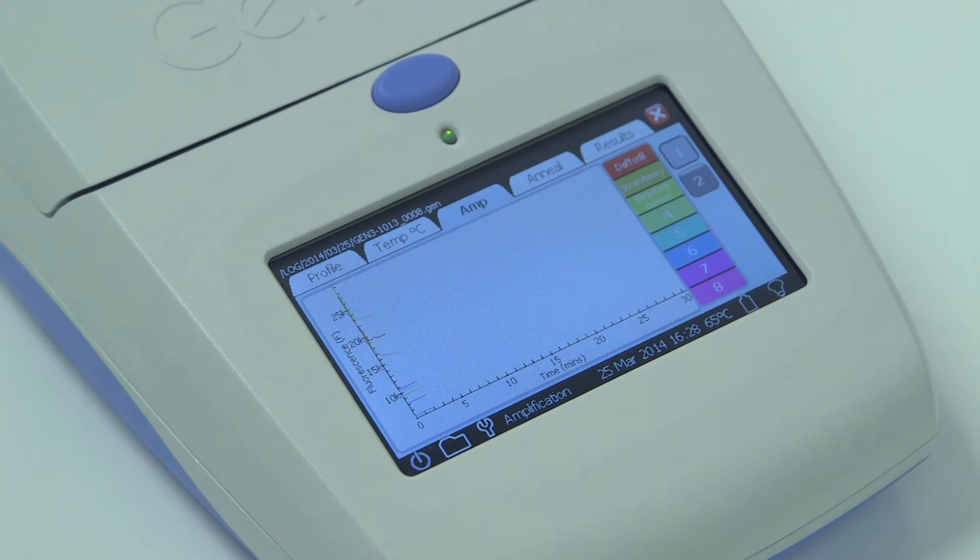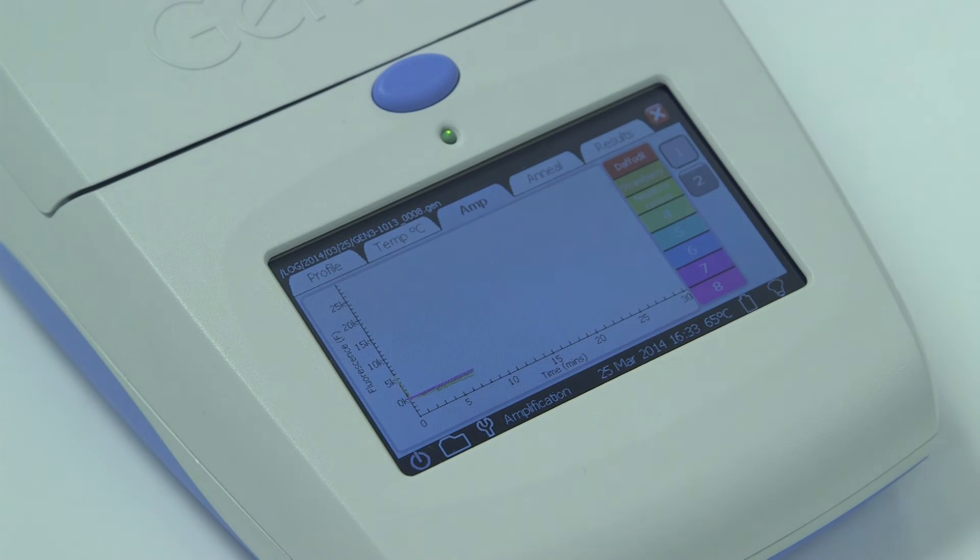Amplification can be seen to occur at 10 minutes for the sample of daffodil petal. Following amplification, perform an annealing curve which verifies the correct amplification of target. Results are displayed as time of amplification, and the anneal curve confirms the correct target.